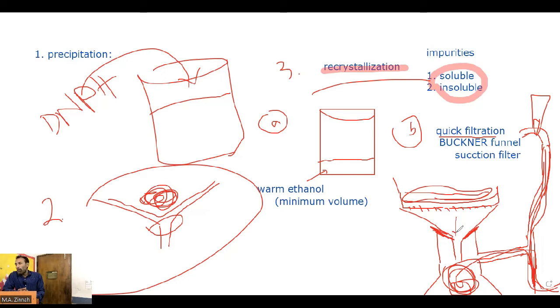তো এভাবে আমরা দ্রুত ফিল্টার করে ফেললাম, and this filtration removes any insoluble impurity present with the sample. কারণ যেহেতু ফিল্টার করছি, যদি কোনো insoluble impurity থাকে that did not dissolve in the ethanol because that's insoluble we say, তাহলে এখানে সলিড রয়ে যাচ্ছে এবং এটা ফিল্টার পেপারে আটকা পড়বে। ক্লিয়ার? Only the solution will pass through, শুধু সলিউশনটাই চলে যাবে, বুঝে গিয়েছে?